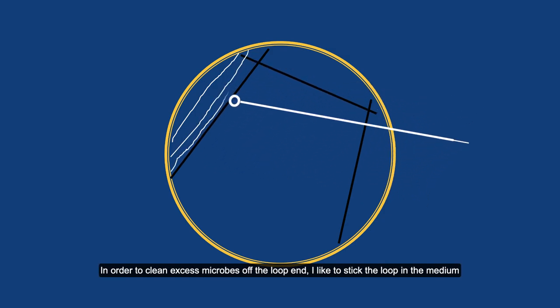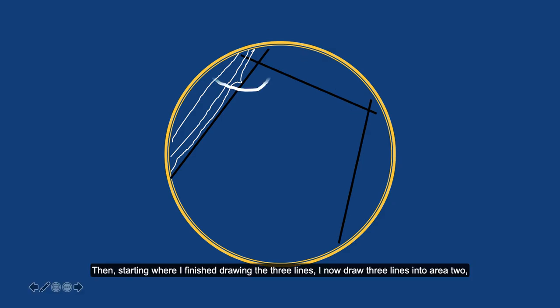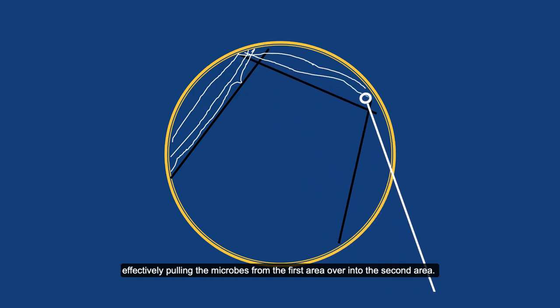In order to clean excess microbes off the loop end, I like to stick the loop in the medium in an area where I have not put any microbes yet, and I do that after every streak. Then, starting where I finished drawing the three lines, I now draw three lines into area two, effectively pulling the microbes from the first area over into the second area.